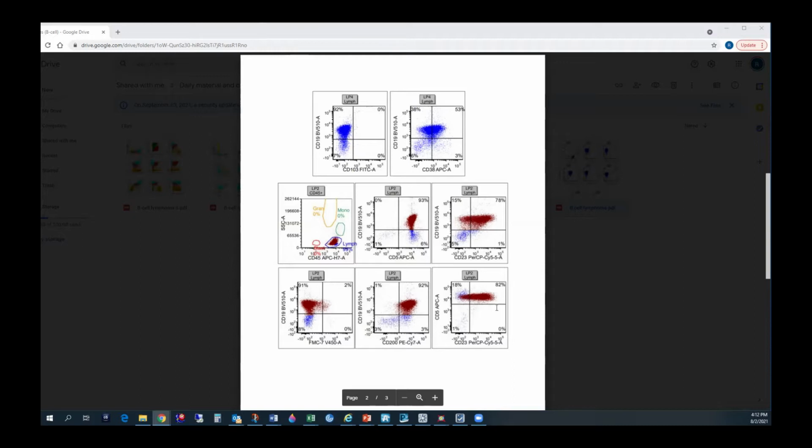Hairy cell, I have to see. Yeah, I've seen it positive, but I don't know if it is very strong. I mean, it is not a specific hairy cell marker. That's the thing: Mantle is negative. That's what helps. Yeah, that's where we use it.